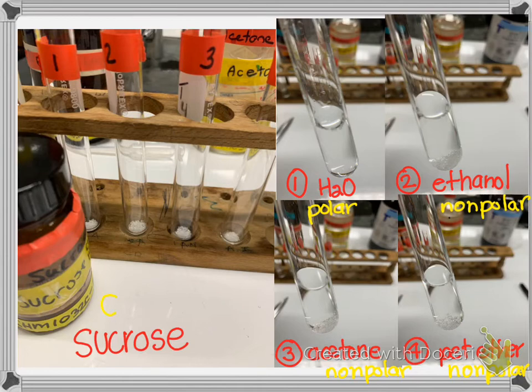Now, sucrose is C12H22O11, and these oxygens right here make sucrose polar. So if sucrose is polar, we have polar and polar. There is nothing there. It is soluble because like dissolves like, polar and polar.